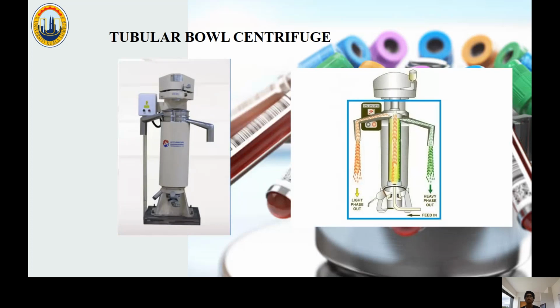The picture on the left side shows how the tubular bowl centrifuge looks like in real life, and the other picture shows the process inside the tubular bowl centrifuge.